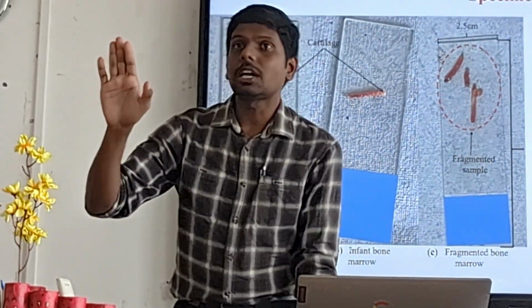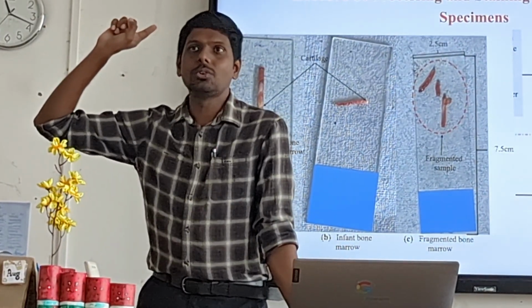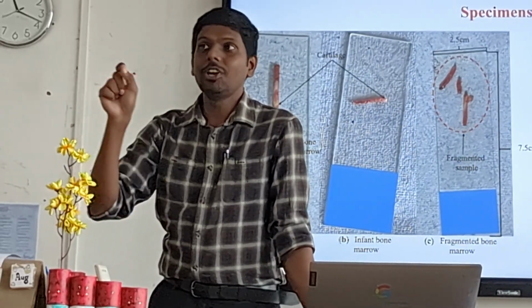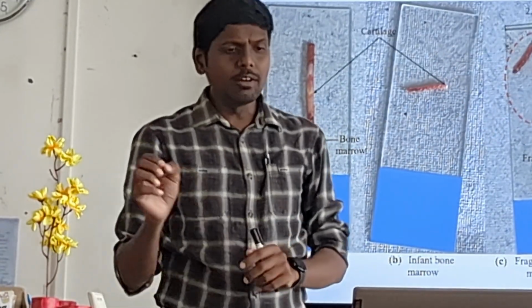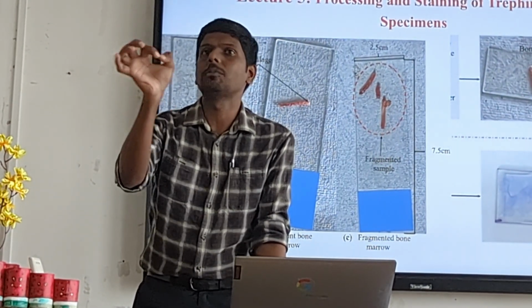I'm not going to touch on how we obtain the sample; we already finished that on day 2. So we are not minding about patient preparation or collection. We are only minding about the processing of the sample and the results interpretation. Whenever there is the word biopsy, can you define what a biopsy is?